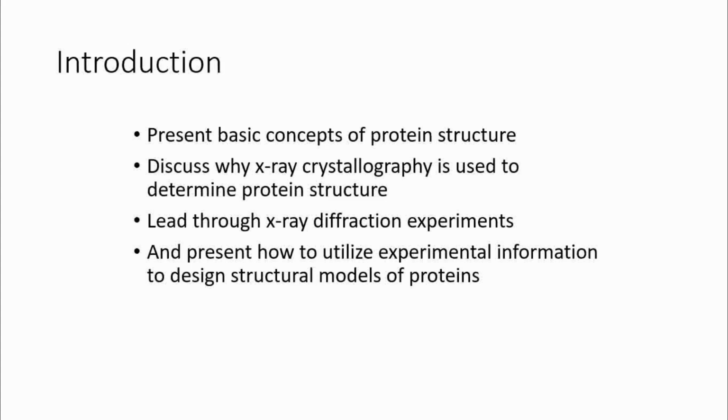Now, taking a step forward, we are also interested to understand more about the structural orientation. See, in the previous session, where we had circular dichroism, there it was more like there has to be an optically active compound or molecule in your sample. It may be a chiral carbon, and because of this chirality, the rotation effect was happening, right? Now, this rotation effect is only one portion of it, which tells whether it is dextro or levo rotatory, but that information is not sufficient to give you the structural idea. So there is another technique by which we are going to understand, and that is X-ray crystallography.